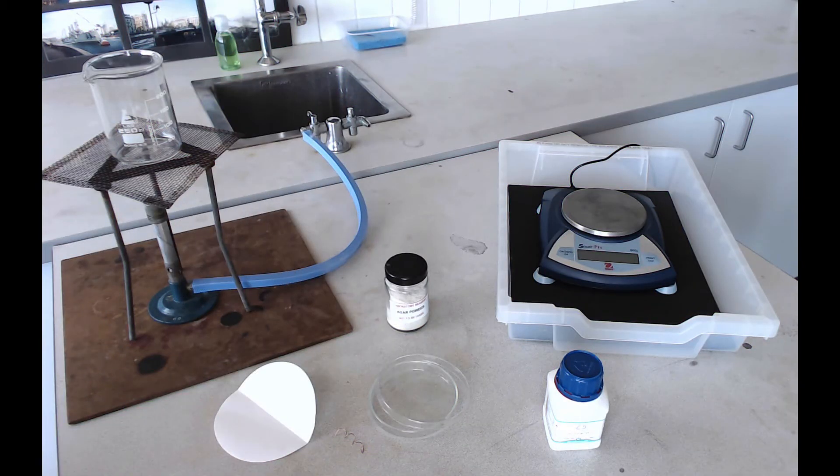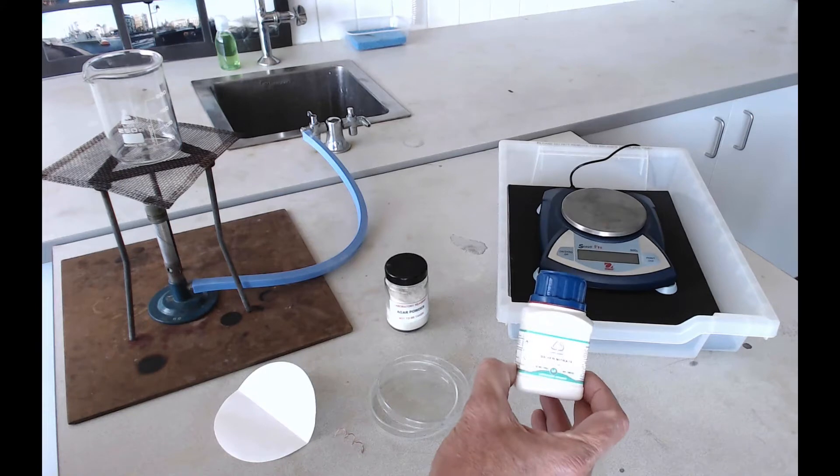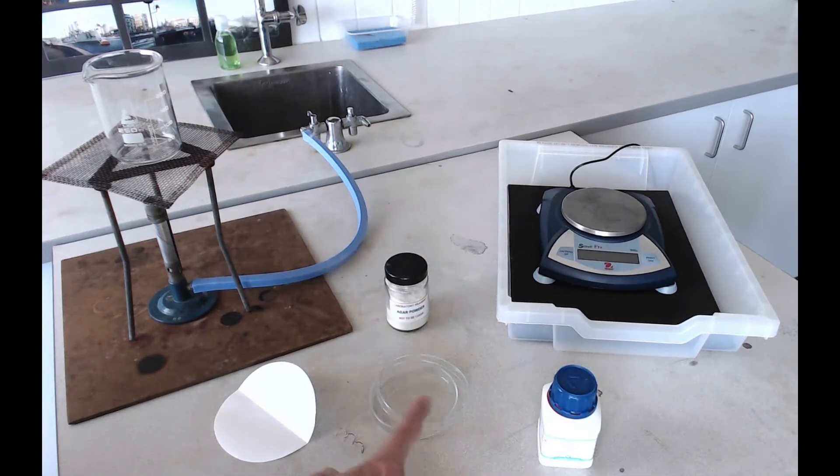Hello and welcome to this film which is all about the Making Metal Crystals practical. For this practical you're going to need access to some solid silver nitrate, a petri dish, and a coil of copper wire.